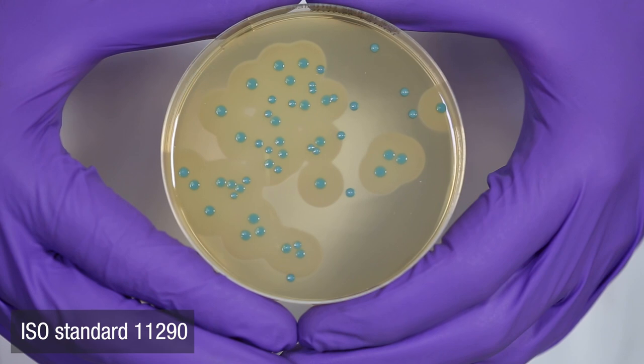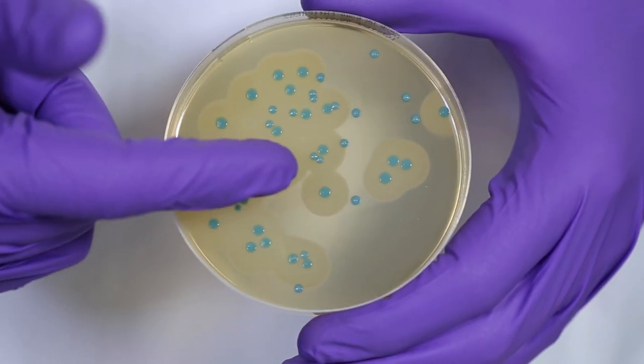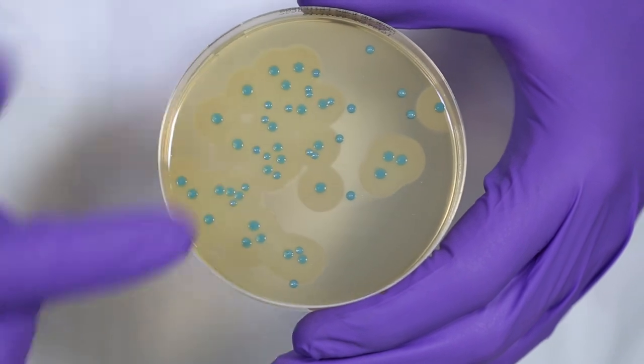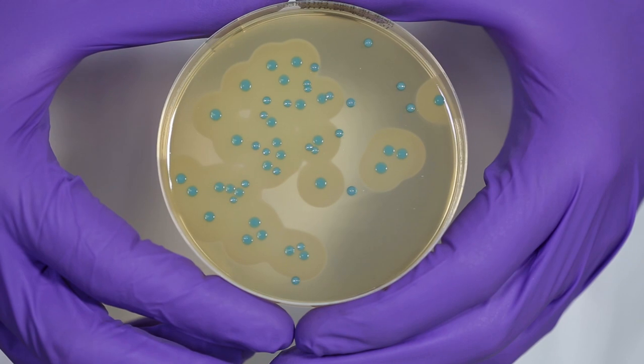Here is our Listeria chromogenic agar as described in ISO 11290. Pathogenic Listeria monocytogenes grows on the agar as a green colony surrounded by an opaque halo. The agar contains a cocktail of antibiotics that exerts selective pressure on non-target organisms and inhibits them.